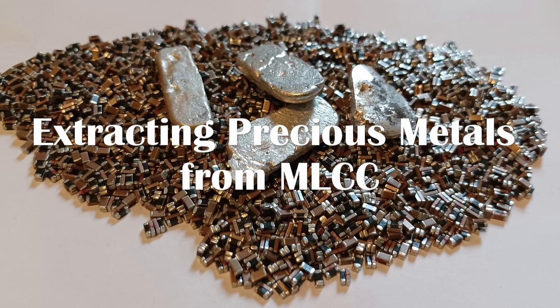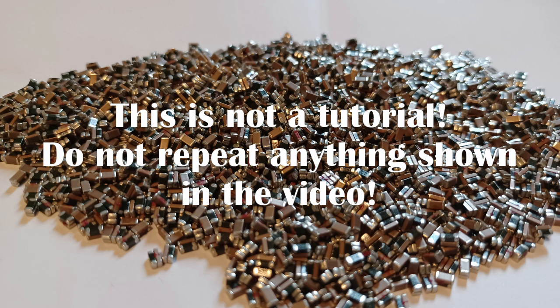Hi everyone. Today I will extract precious metals from multi-layered ceramic capacitors. I will also be explaining some things about them, because I do happen to have some insider knowledge on the matter. This is not a tutorial — do not repeat anything shown in the video.